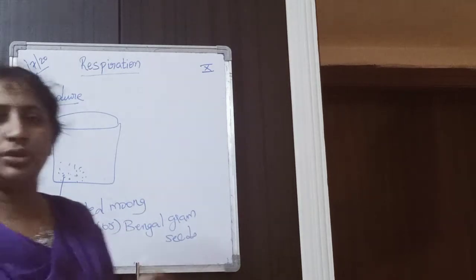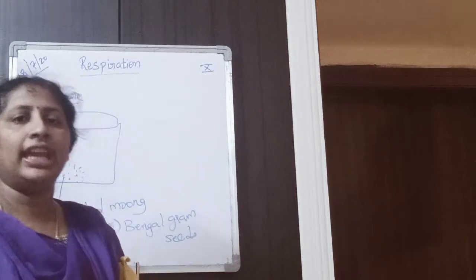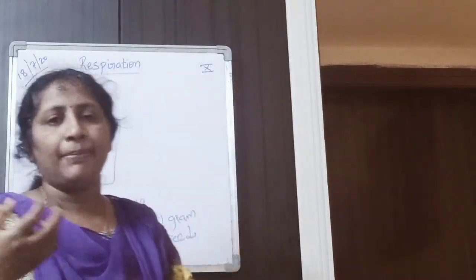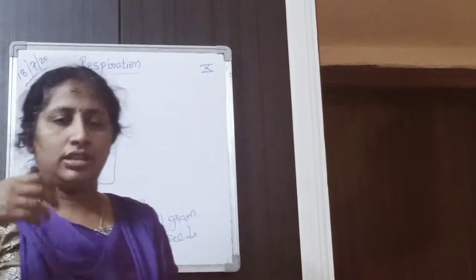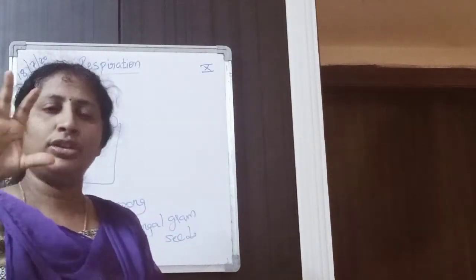If you want to do the experiment today, the day before you soak some moong dal, or black gram, or Bengal gram seeds.